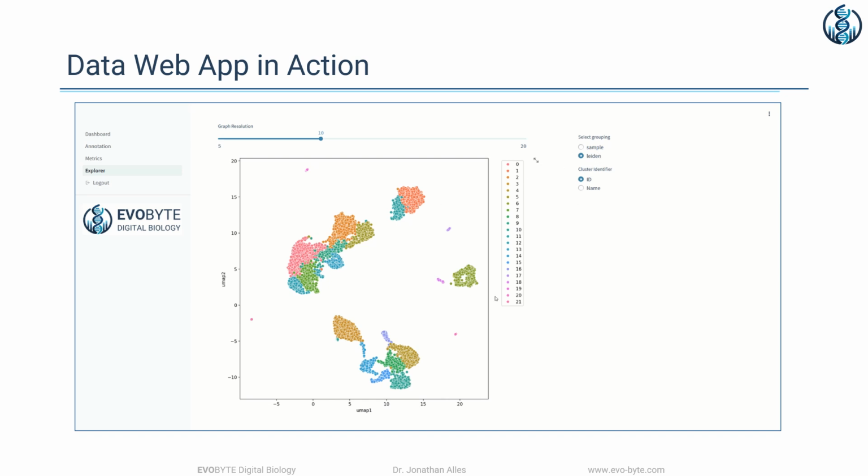So this is basically the single-cell clusters that were identified by the Leiden algorithm, and that are then in some way representing our cell types or our cell states. And these are typically a first point for a downstream analysis that we can perform here.